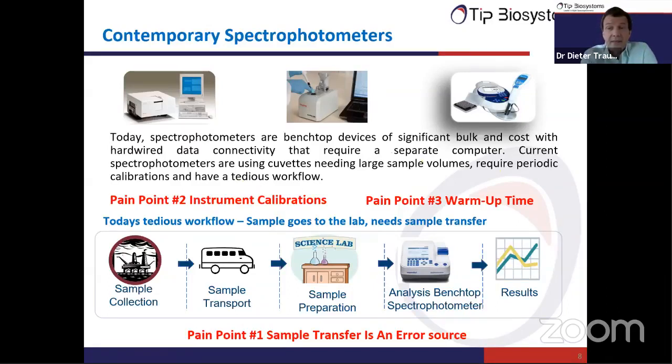calibrations regarding the wavelength accuracy. Do you measure really the correct wavelengths? Because such instruments have moving parts and so on, and the wavelengths can maybe change. This problem with the wavelength change can be addressed by an instrument using filters, or an instrument similar to what we built, which uses an LED, a light-emitting diode, because they do not really change the spectrum.